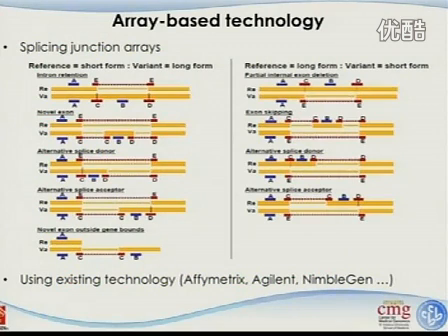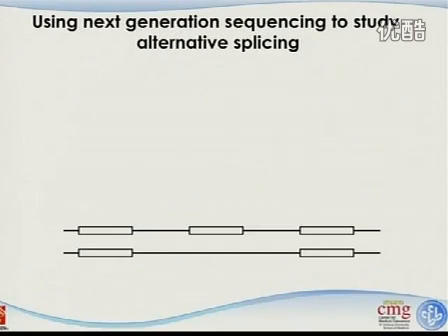You are not guessing there's an exon here. You know there's an exon here. You know there's a splicing that could occur there. That's the only way that you can design the probes to target that. On specificity, I mean, the data will look very, very good for the ones that you're targeting, but you are potentially missing a lot of other things. Okay? Does that make sense?